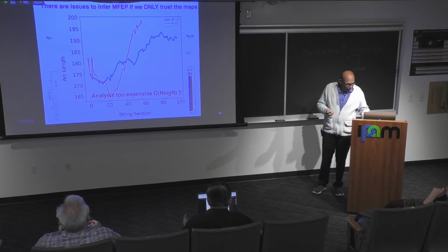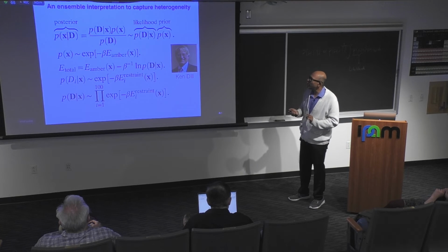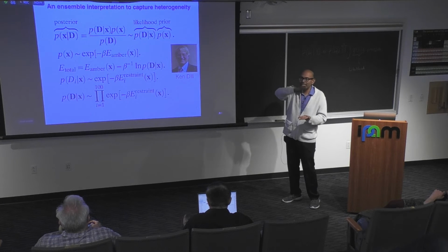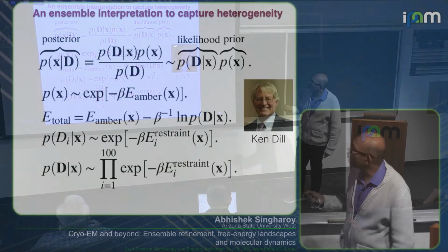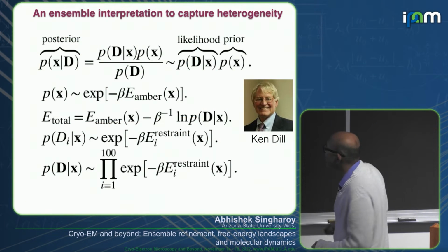So now we came up with another way. When I talk about a pathway, I'm very, very interested in only the milestones on the pathway, and not necessarily the barriers that I want to overcome. Let's say I give up on the energy barriers on the pathway, and we start doing maximum likelihood calculation. So what is maximum likelihood? We've already seen that here.